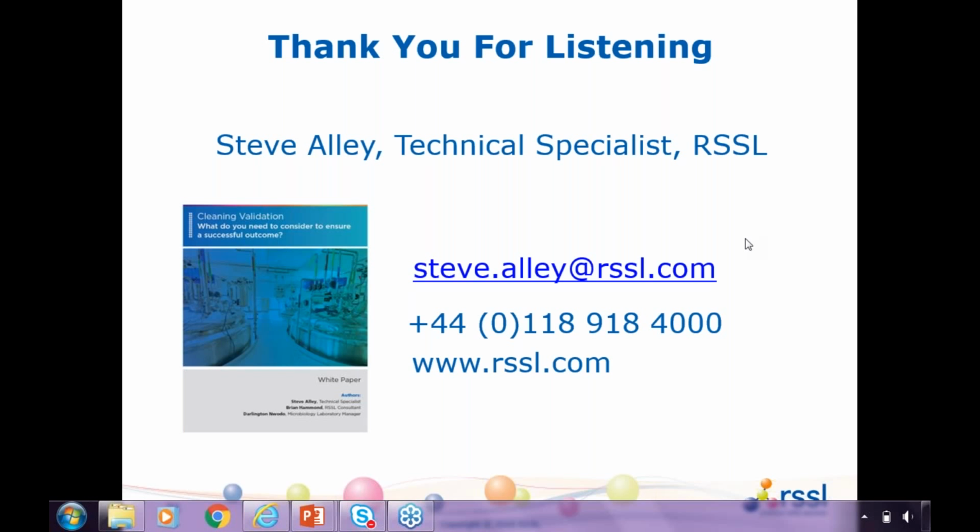Now this would be a case, so for example, let's just take a recovery of more than 50%. So long as you can show that you're getting a consistent recovery, so your precision between your replicates is good, and you can do that over several days and several HPLC systems, for example, whatever technique you're using, then that gives you grounds to say, right, well, we know that with this technique on this surface, we're only going to recover this amount, therefore we can put a correction factor in place each time we analyze that, that's fine.